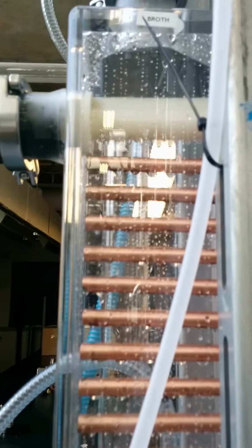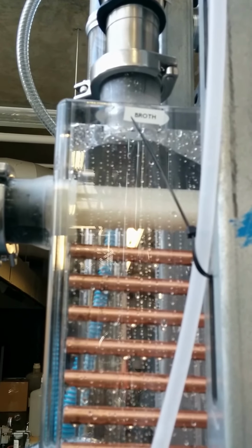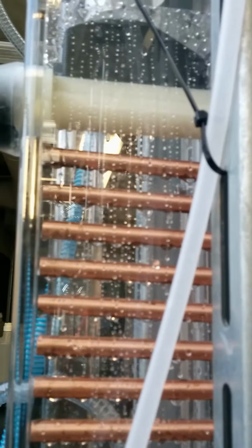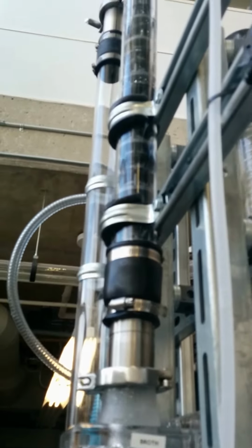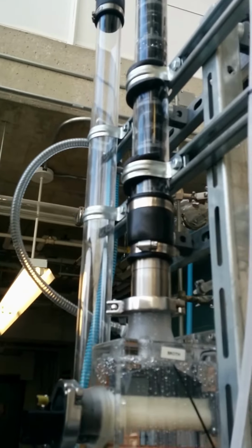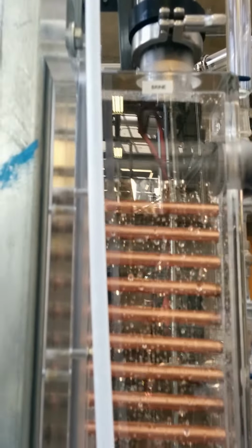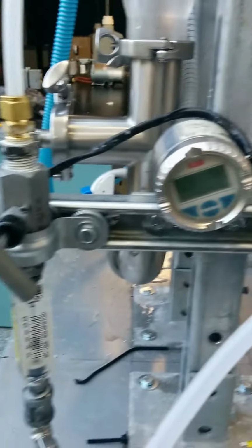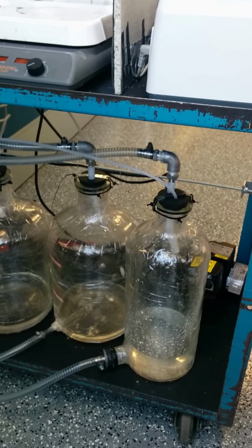And we don't have the distributors on, and as predicted, that distributor is a bit tight, and we have sort of overflow, but the liquids are going into the funnel. And the column is working well, and so is the other column over there. And we have successfully operated, and here we're at 33.6 torr, and we have liquid flowing into our receivers.